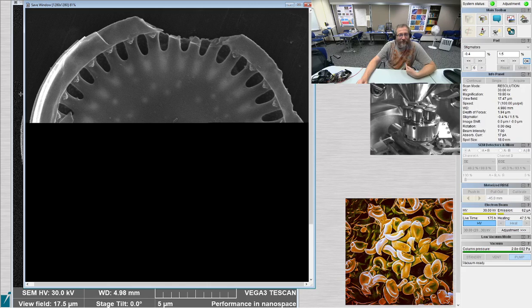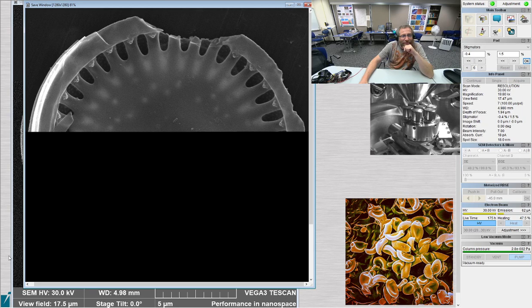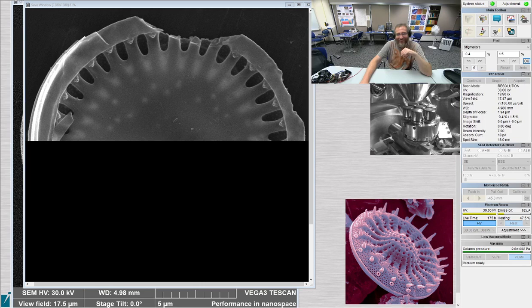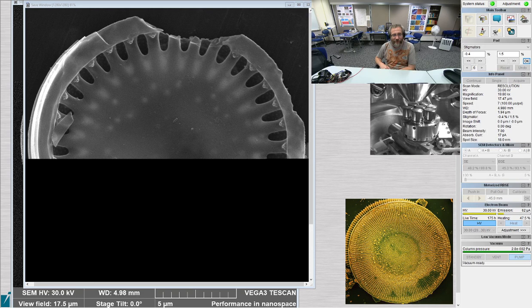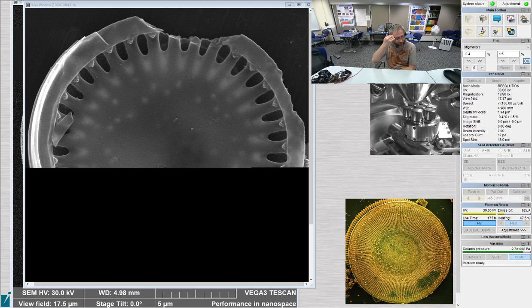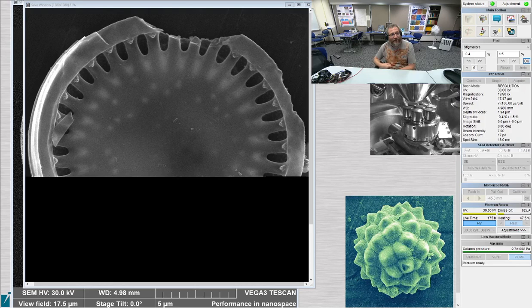If you could bedazzle your hair with these. You probably do if they're in a little bit in your tap water, right? Depending on your drip. Mine comes from a well, so probably not. We have looked at human hairs in the SEM before. We also looked for Demodex growing on human hairs. We've had some of my beard hair in there, some of my eyebrow hair. On purpose? Yeah, on purpose. We were looking for the little mites, and we never found any on me.